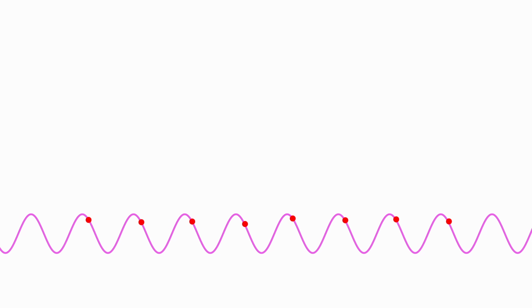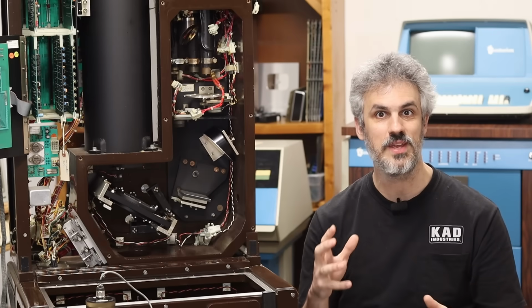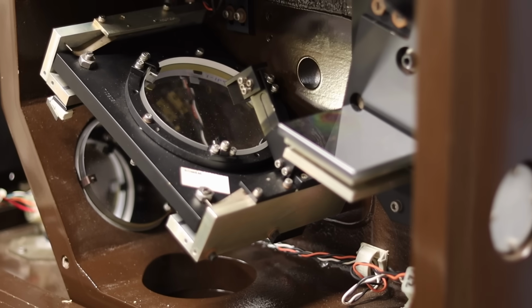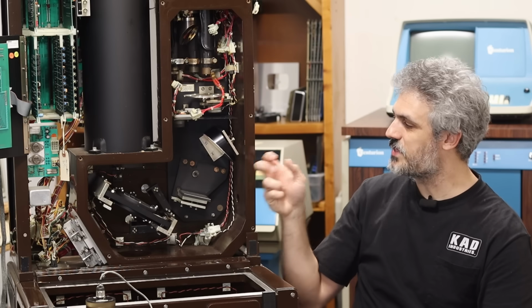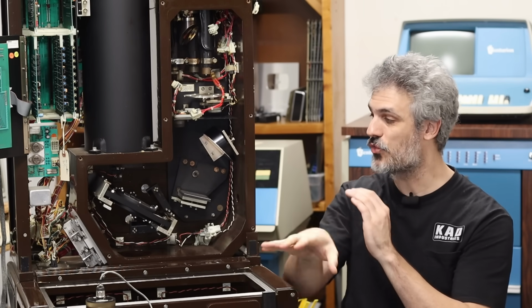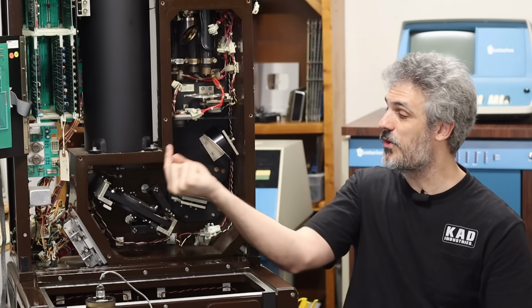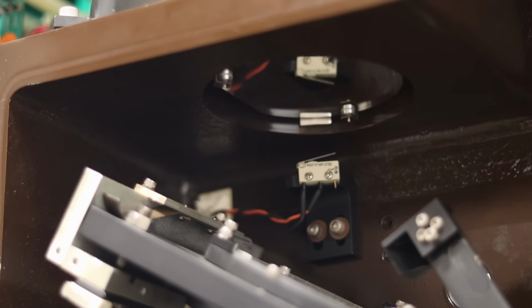And so we don't end up getting a good image of what that sine wave looks like overall. So we've got to do some tricky stuff here to shift things around and get a better image of how that sine wave looks. And we do that with this beam splitter and the movable mirror. Now, as our emission source comes down and reflects through, it hits the beam splitter, and half of it passes straight through and hits this fixed mirror on the back.